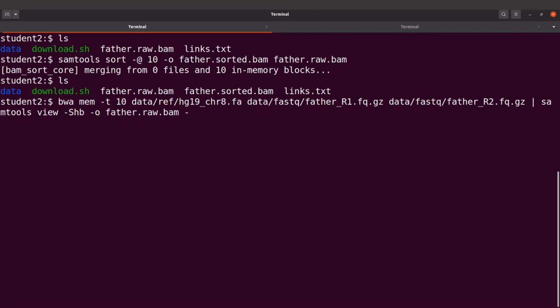Okay, so the problem comes when you have lots of samples. When you have multiple samples you want to analyze or map, this is where automation comes in. So I'm going to give you some tips and some advice. I'm going to demonstrate how you can use some bash commands to automate this process of genome mapping, so that once you have your data set, you can quickly get your work done. So that's what we are going to do next.